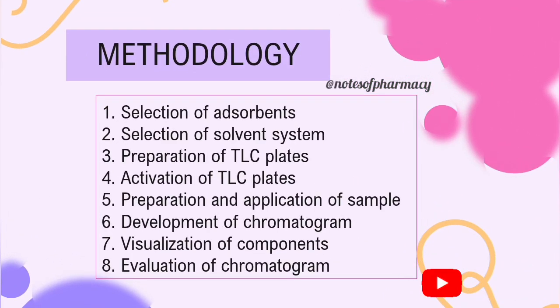Coming to the methodology. In this, 8 steps are involved: selection of adsorbents, selection of solvent system, preparation of TLC plates, activation of TLC plates, preparation and application of sample, development of chromatogram, visualization of components, evaluation of chromatogram.